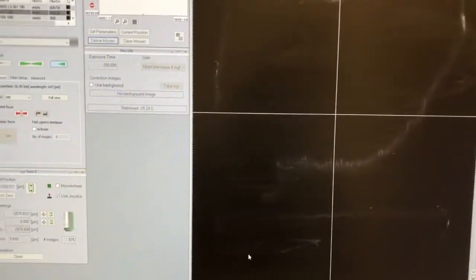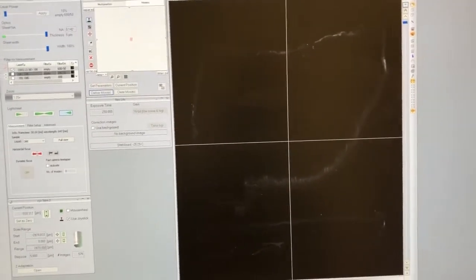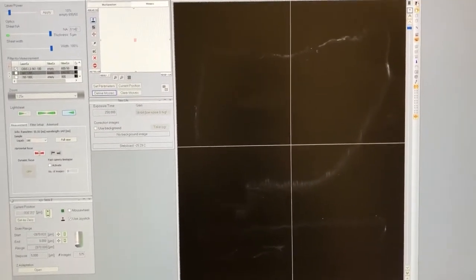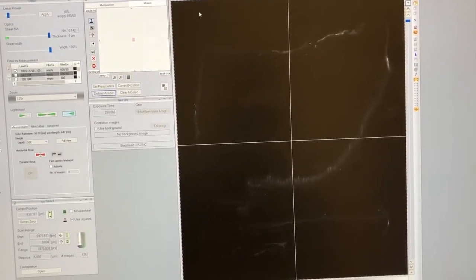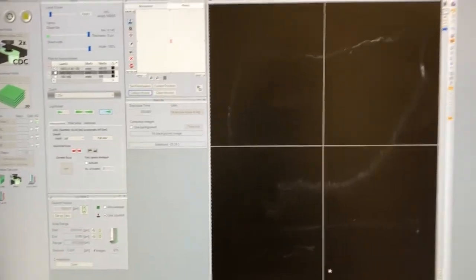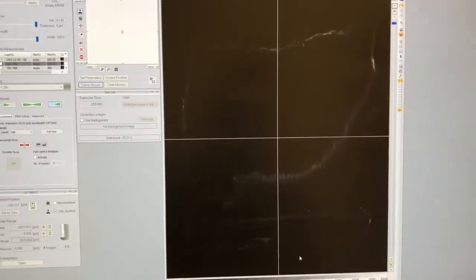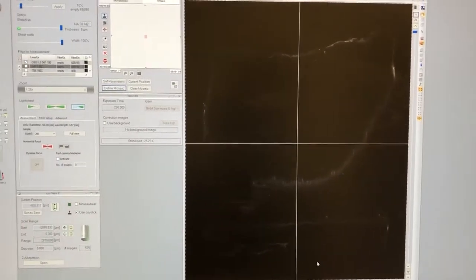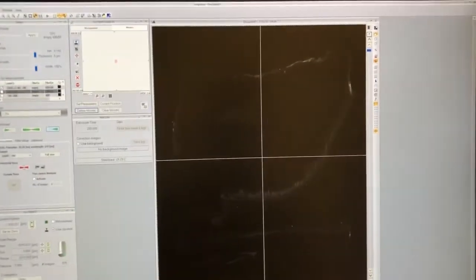What you'll see is that now everything became dark. The reason is when you click this, what the software does is it finds the smallest pixel intensity and makes it black, and then it finds the largest pixel intensity and makes it white, and then just scales in between linearly.